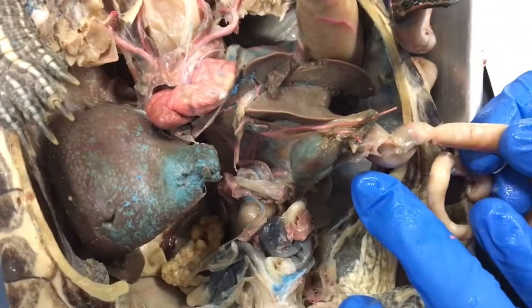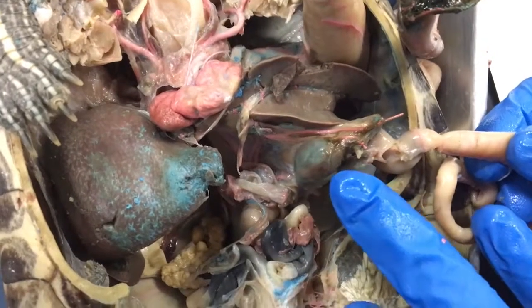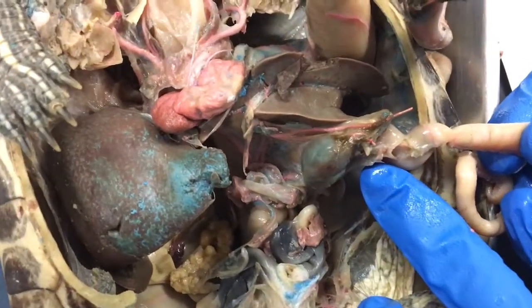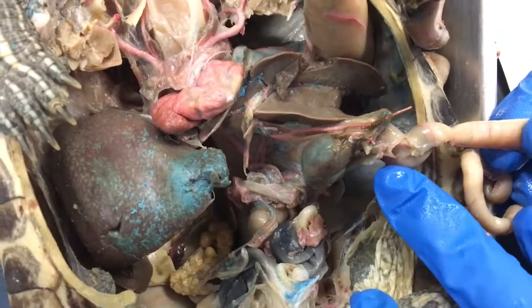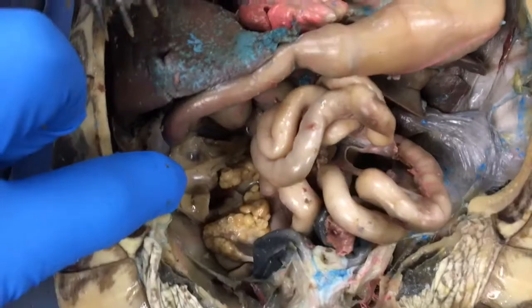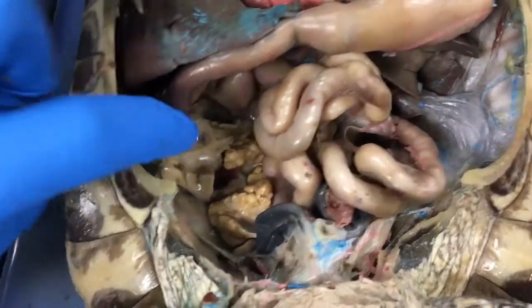This right here is the gallbladder. It stores and concentrates bile secreted by the liver and delivers it to the duodenum through the paired bile ducts. It is a round, green structure. This is the turtle's fat body, which it uses to store food during hibernation.